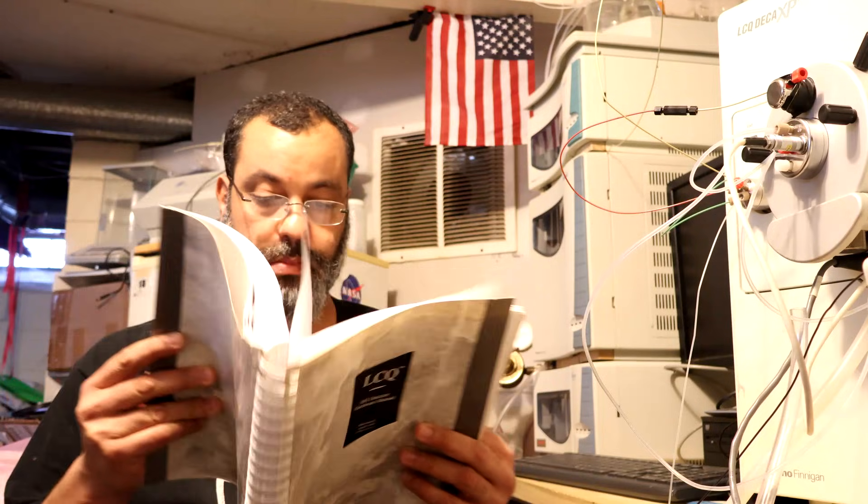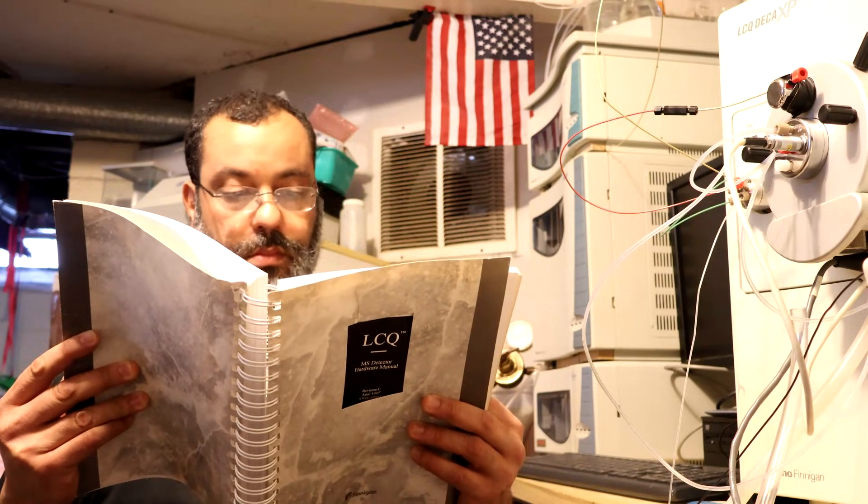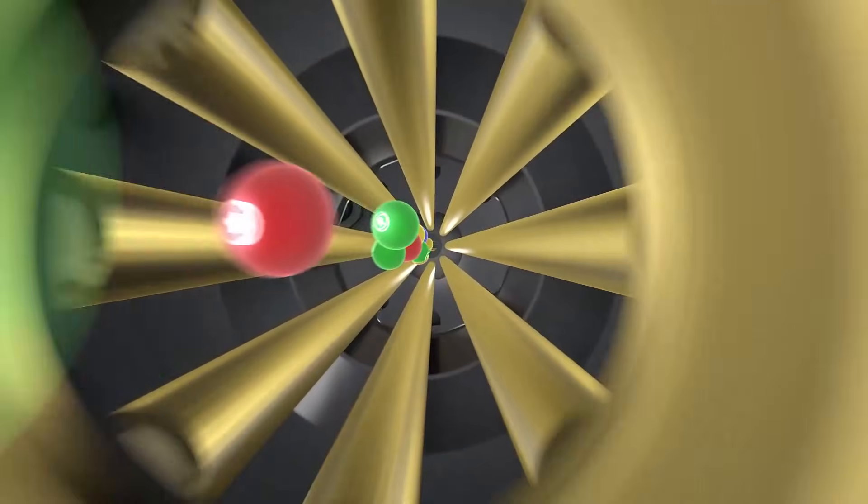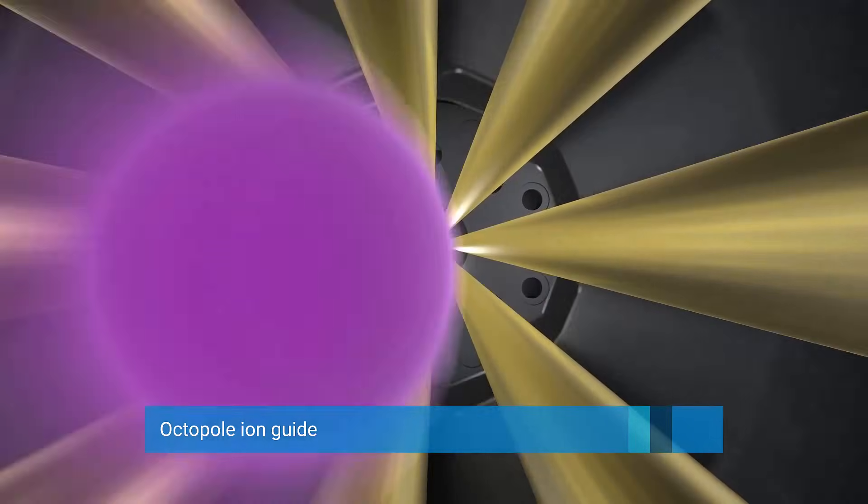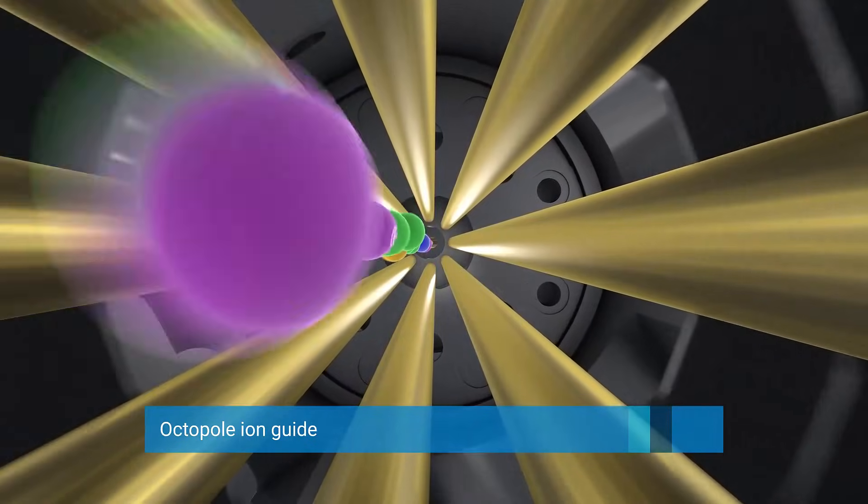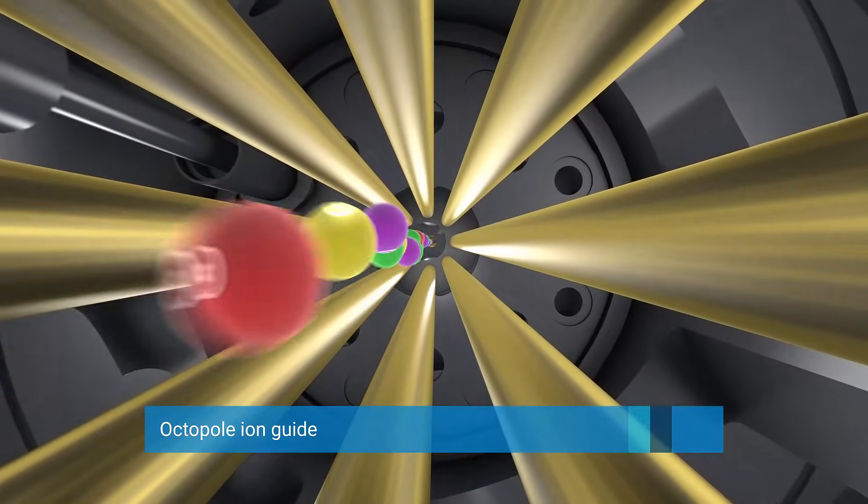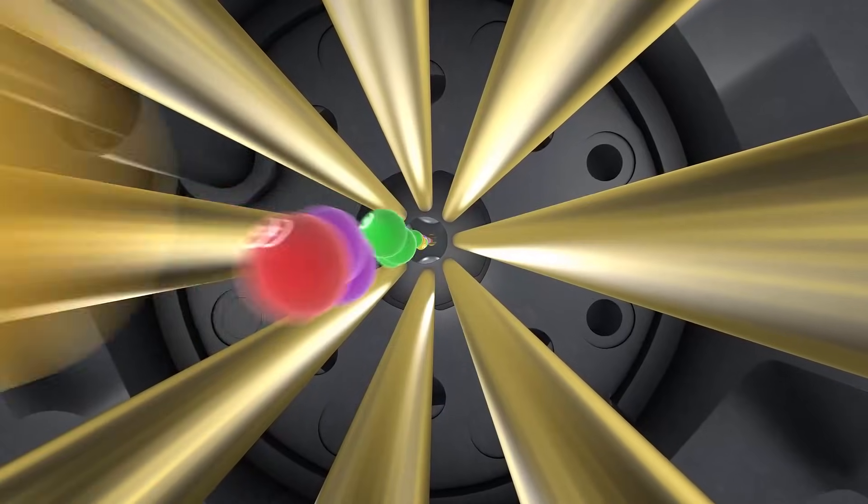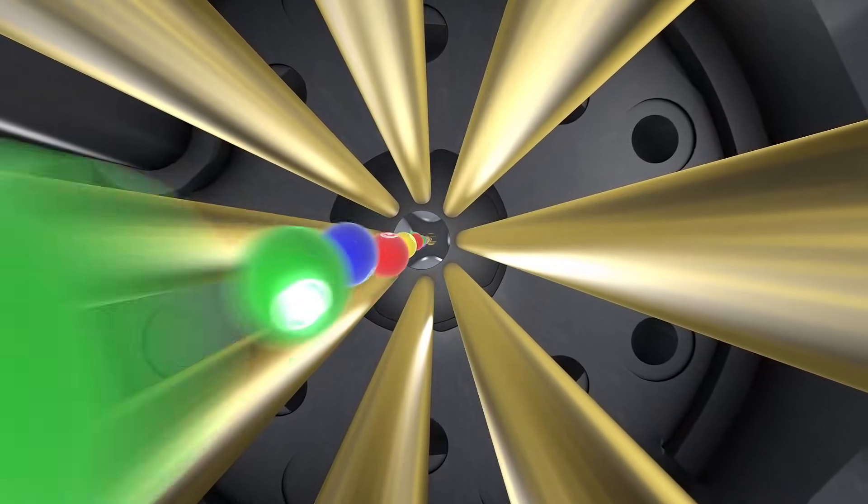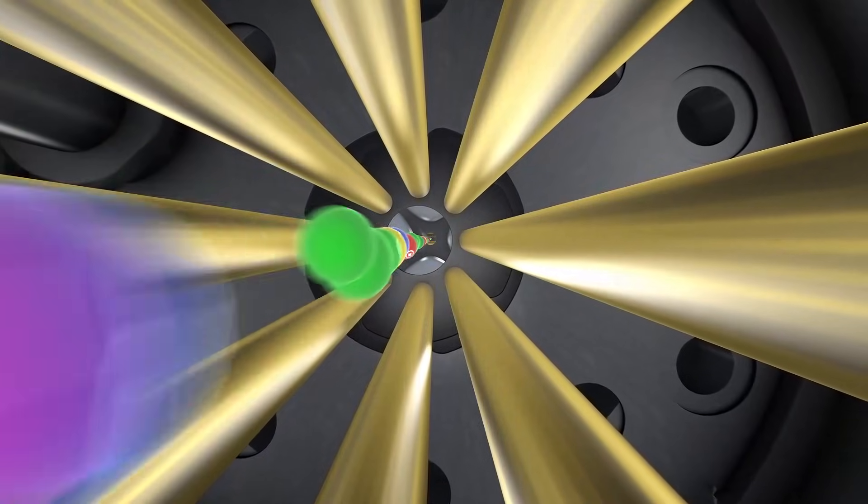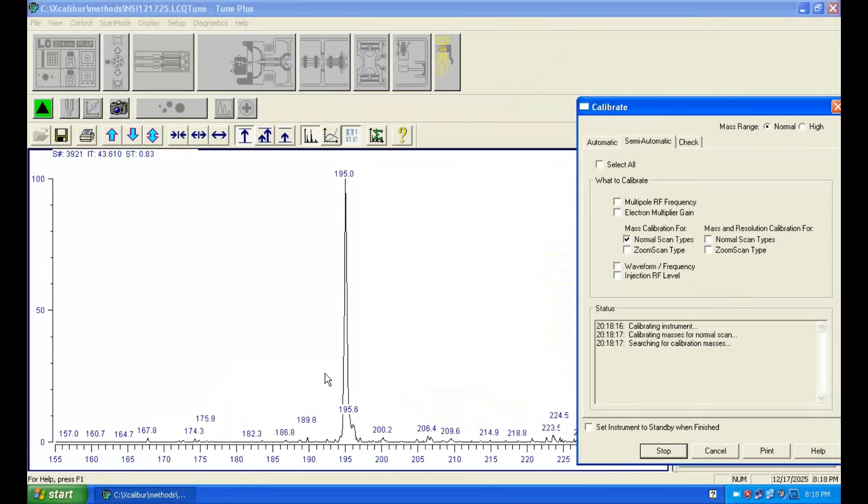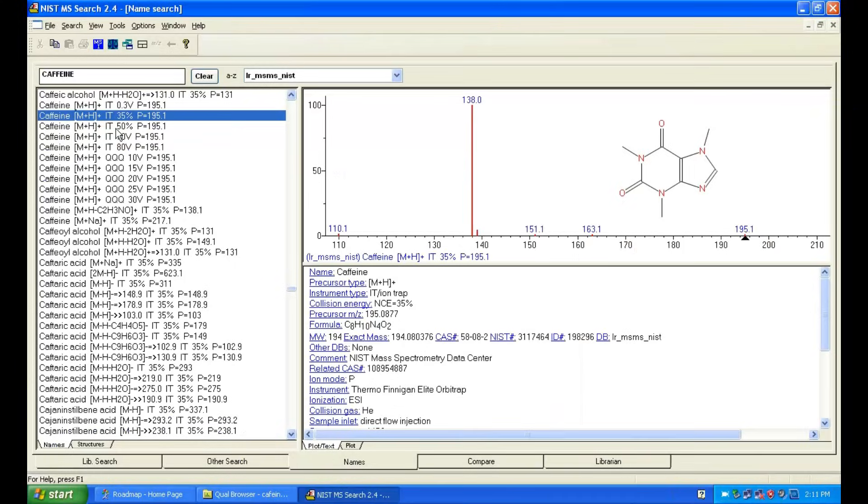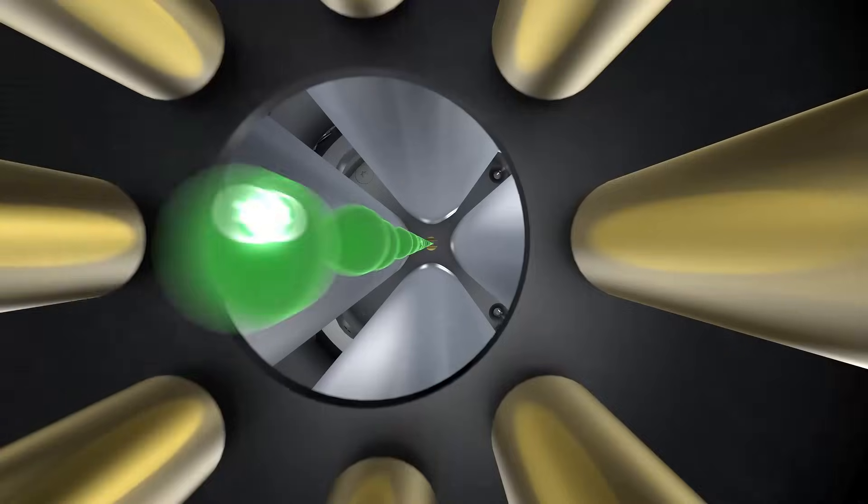At the exception of the ionization mode, the mass spectrometer is working at this point just like the one in the GC-MS. Now there's a second quadrupole, in this case an octopole, lined up in the path of the ions. But why would you have another mass selection device? Well, the mass ionization in the ion source from earlier yields a molecule with an extra positive charge and that will give a single peak on the mass spectrum, the caffeine example from earlier. There are many molecules with the exact same mass that could match this compound, so how could we know what it is?